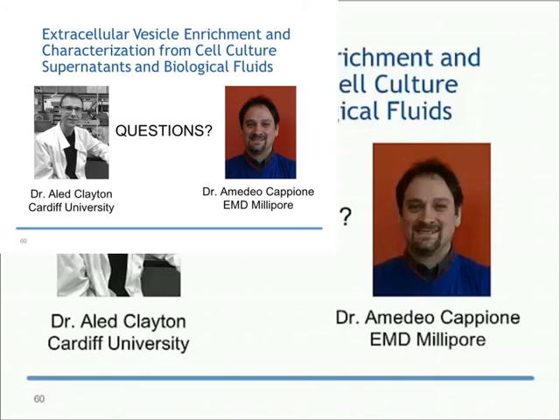All right. On to the next question then. This one is actually directed to Dr. Clayton. It says, how large of a problem is HDL, which has a density similar to exosomes, as a contaminant of the preparations, and what's the best method to remove HDL from an exosome prep?